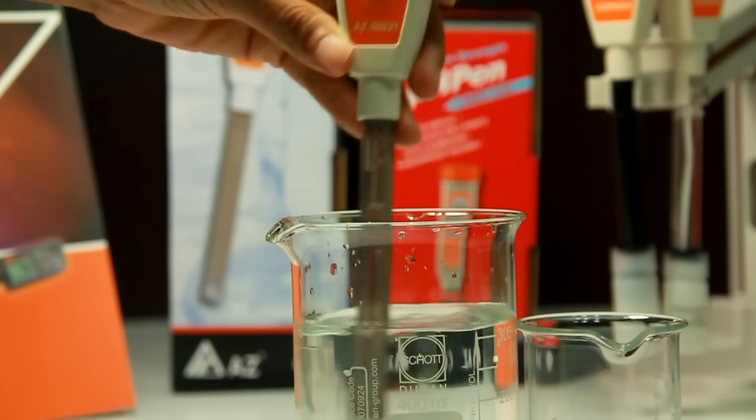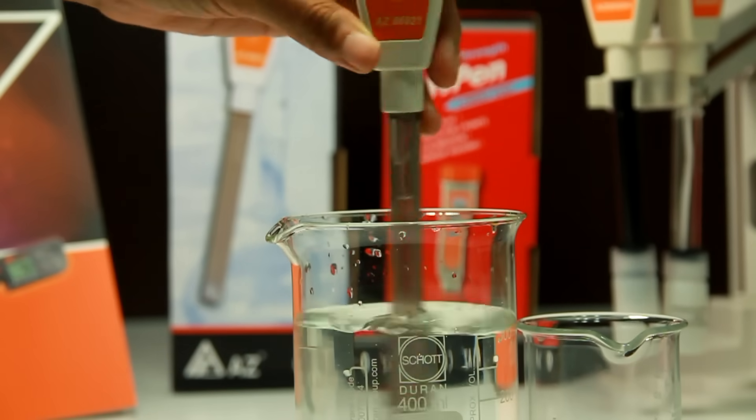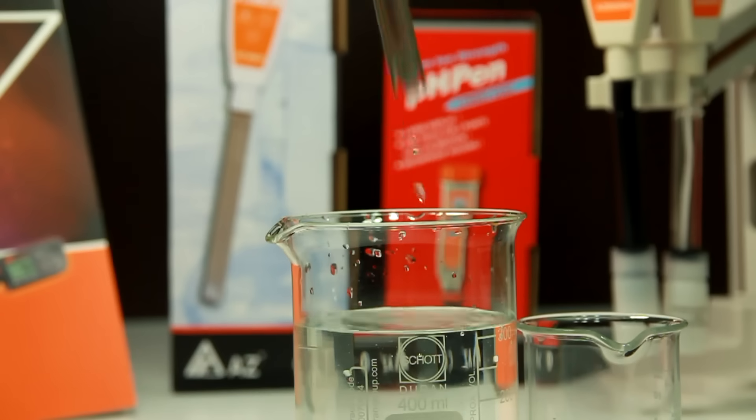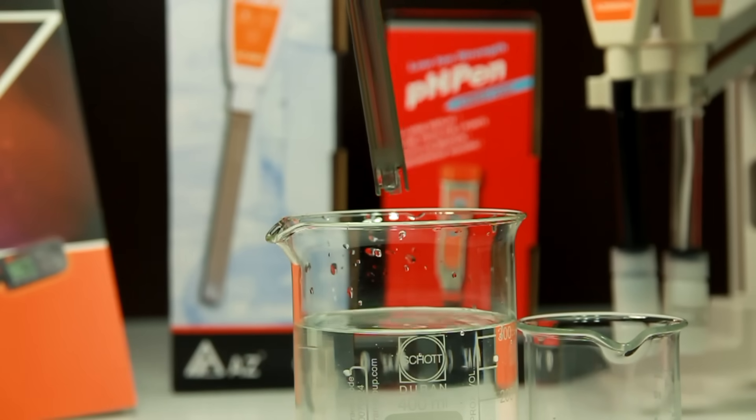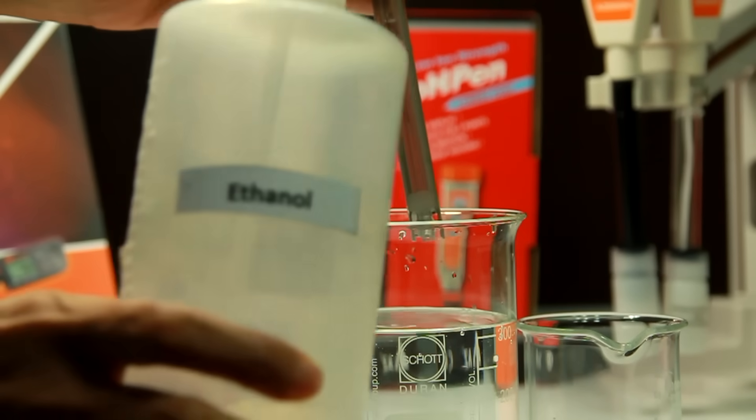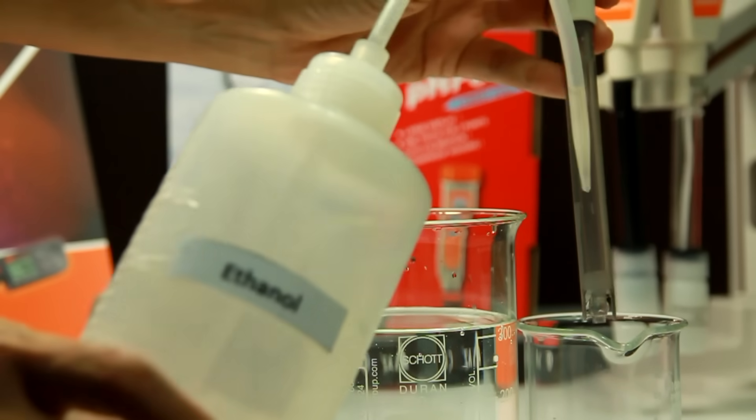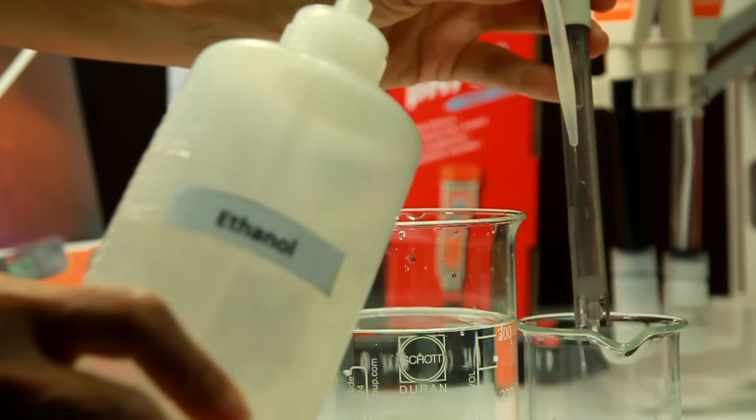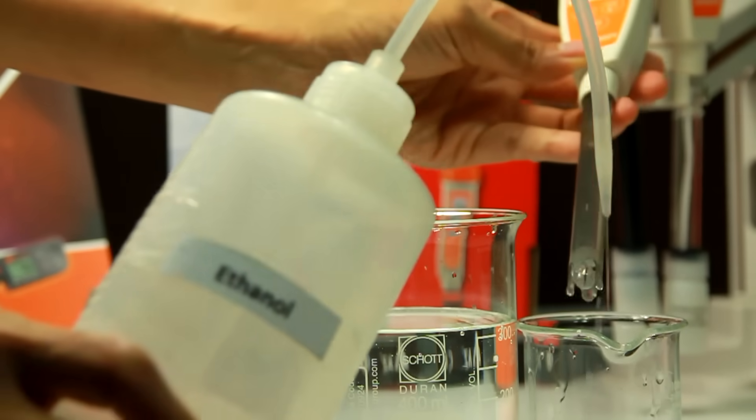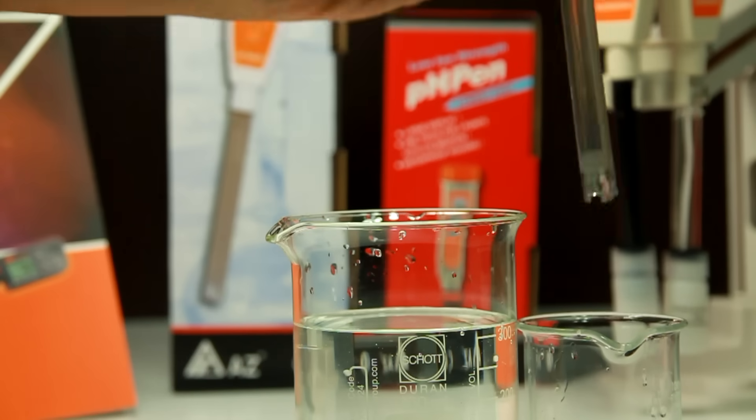Always clean a PH electrode before storage. You may use distilled water to clean and rinse the electrode. If necessary, you may use acetone or ethanol to remove attachment.